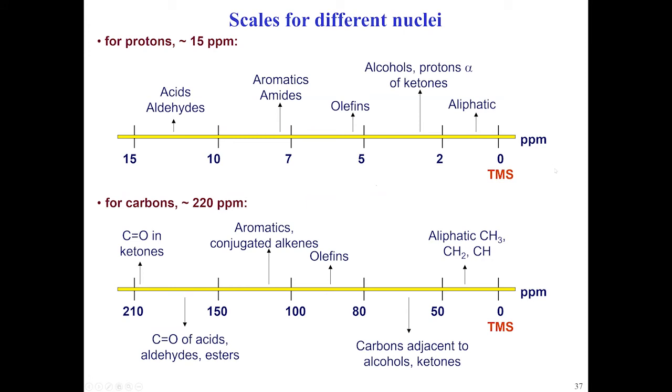And for somebody with a little bit of chemistry background, this is great, because you have on this scale, a proton scale, 0 to 10, 15 ppm. You will have groups that have a positive inductive effect, so will increase electron density, or groups that will pull away electrons very much, like carbonyls, formaldehyde, and so on. And they will delocalize electrons. This goes very well along with the chemist's notion. That's why I say chemical shift as a term. It's in a way very instructive, very useful, because this goes very well also with reactivity that, of course, organic chemists or synthetic chemists use.